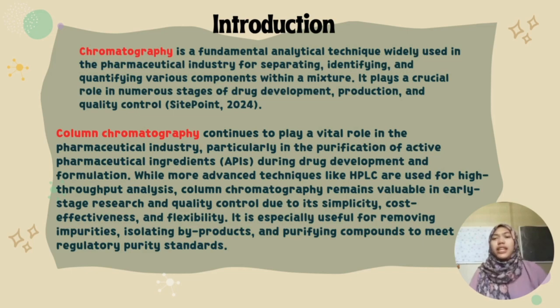While more advanced techniques like HPLC are used for high throughput analysis, column chromatography still remains valuable in early stage research and also quality control because of its simplicity, cost effectiveness, and flexibility. It is especially useful for removing impurities, isolating byproducts, and purifying compounds to meet regulatory purity standards.